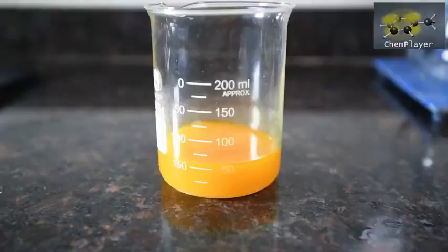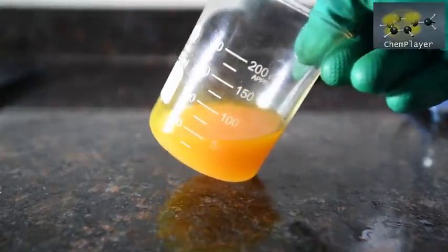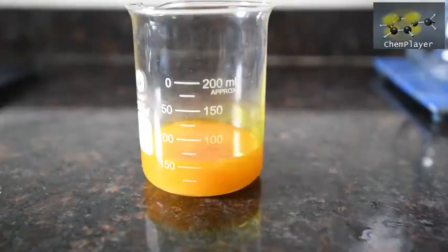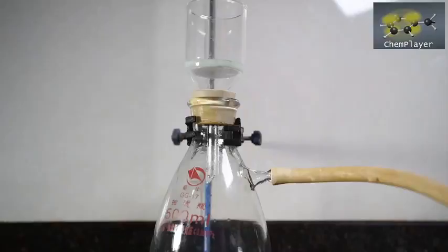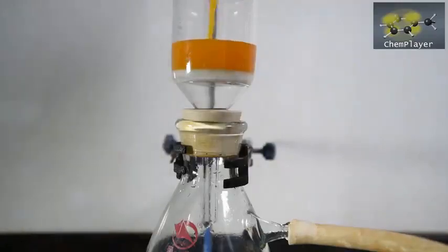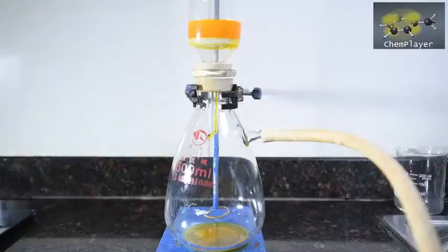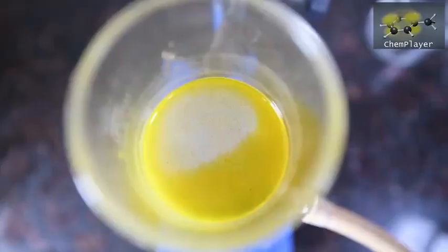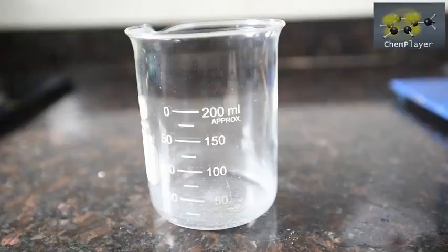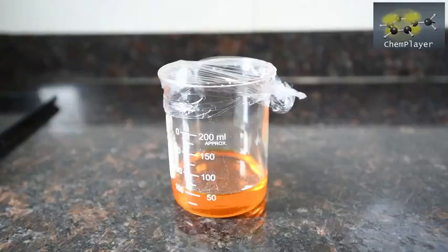The filtrate is slightly opaque, so first we're going to filter it again and see if we can start with a nice clear solution of products. It's also pretty viscous as it contains a lot of salts. We've got a nice clear solution which we'll now cover up and chill in order to see if we can get any crystals forming, so we put this in the freezer and wait.